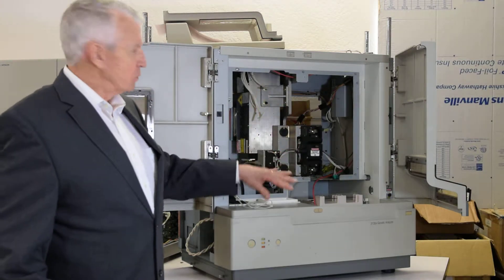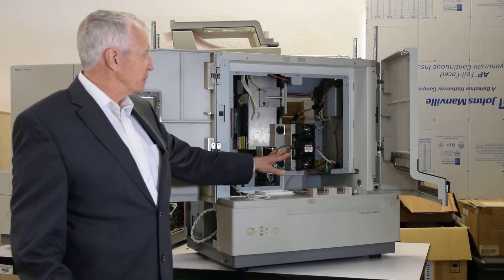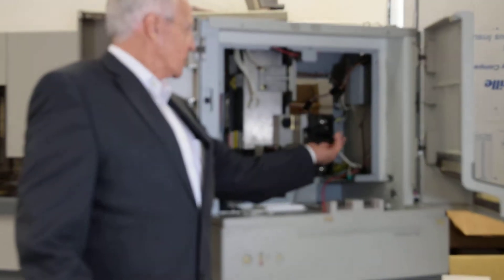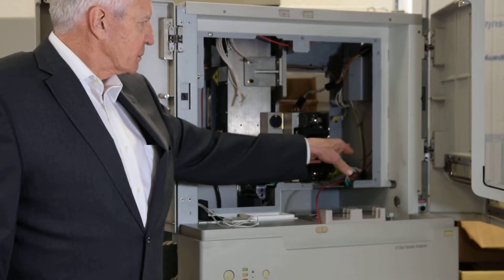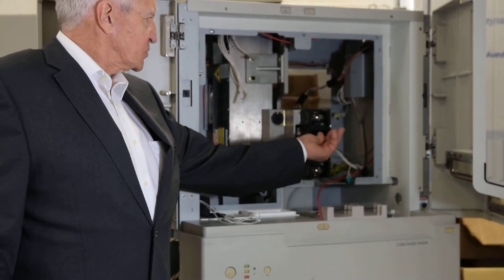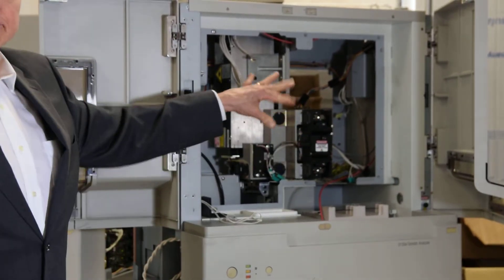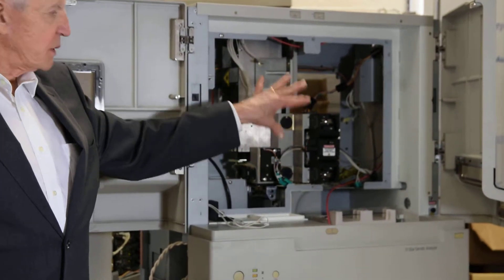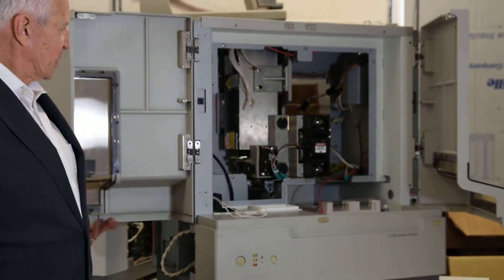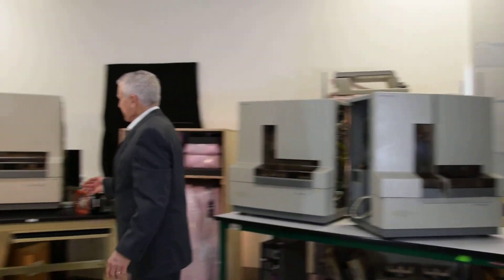We've taken the oven out. We're going to go through it with a Q-tip to clean everything. We want this thing to be impeccable. In here is where the capillary is, and that's where the laser's going to read the instrument. We want to make sure all these optics are perfect so that when we go and start to put it back together, we have a situation like we have here.